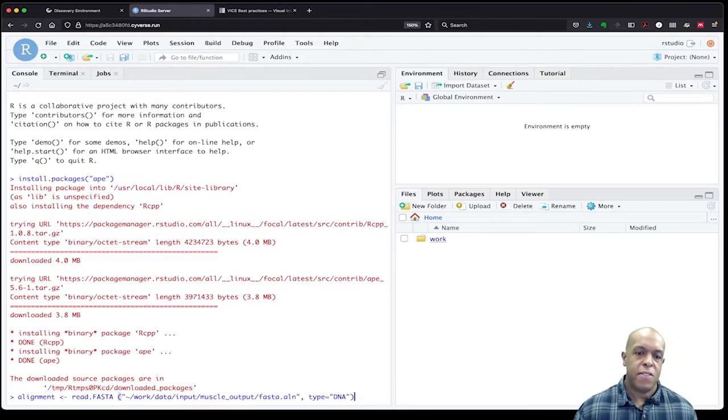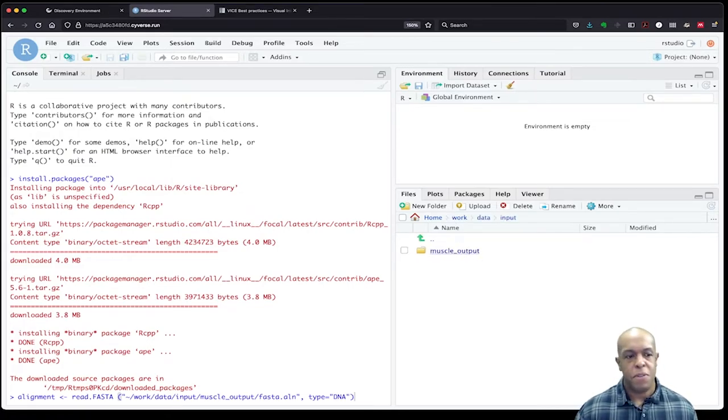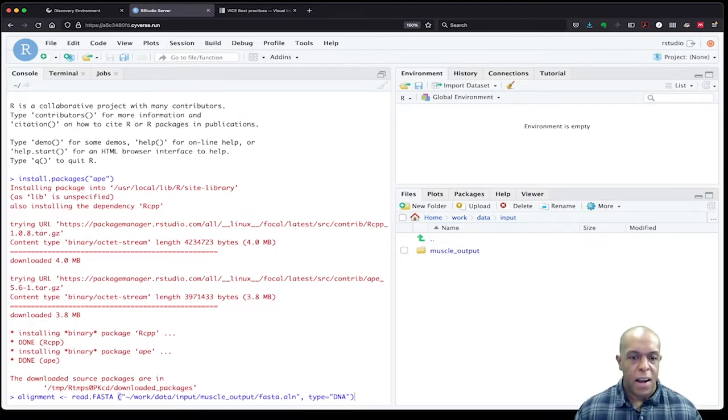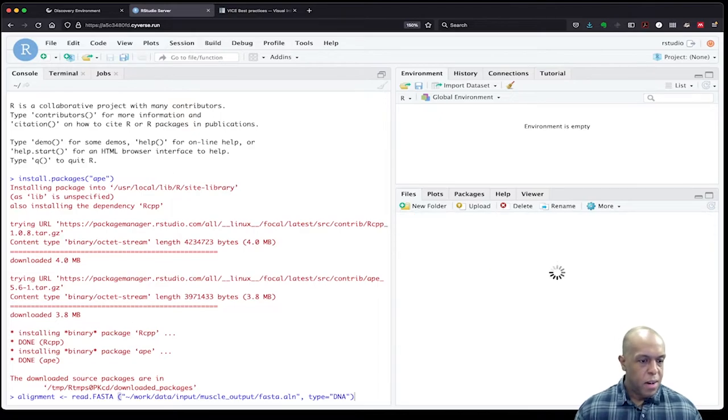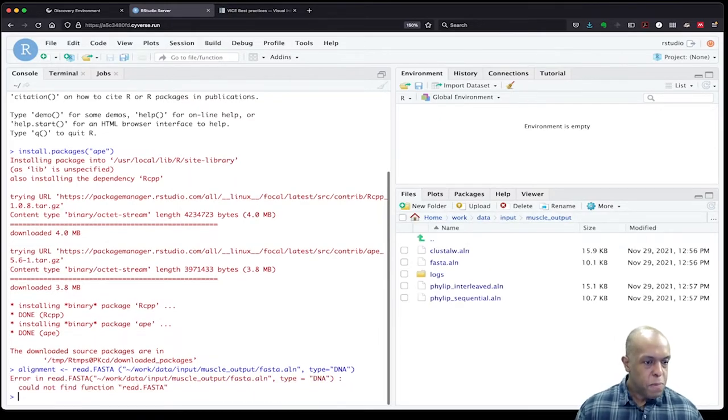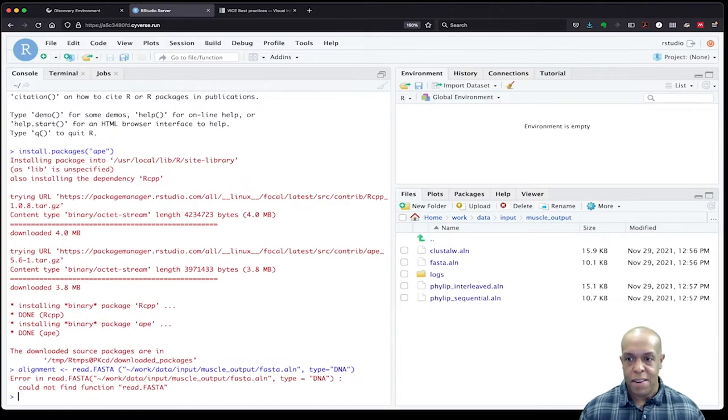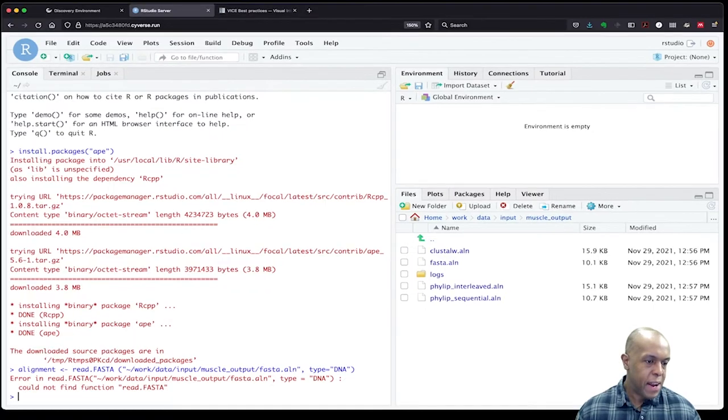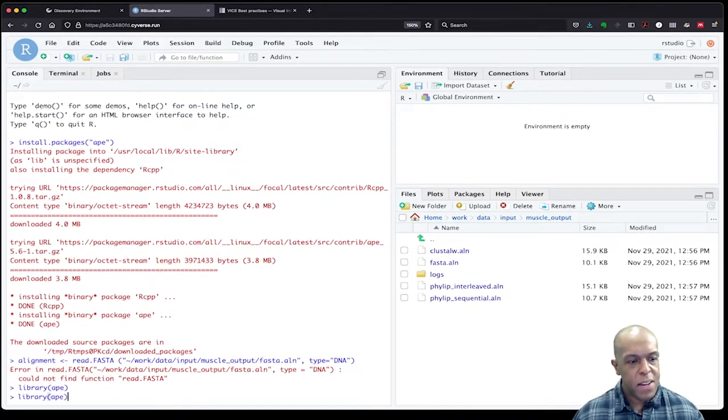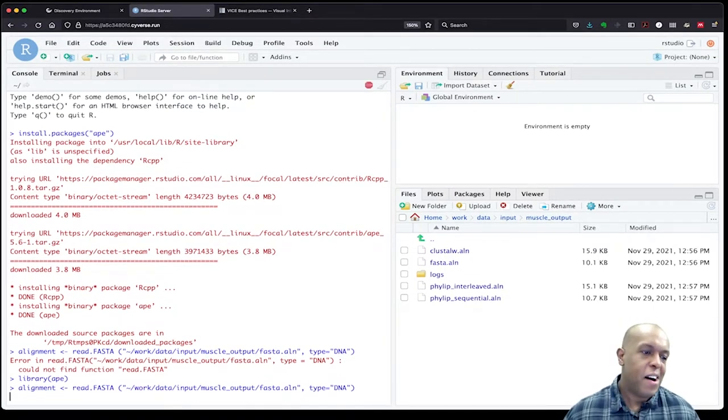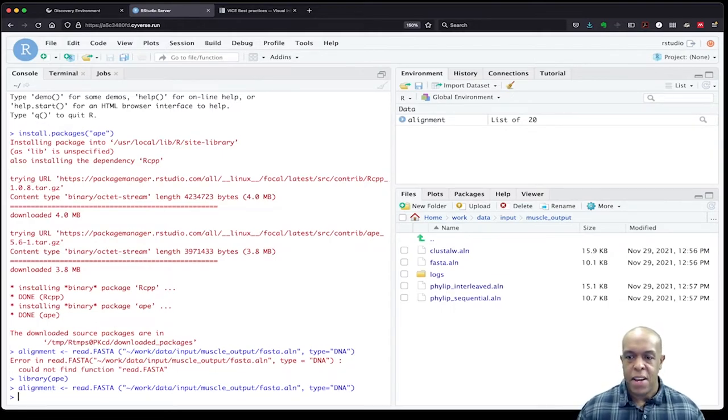In your work directory, which is going to be automatically created for you when you start this, if I go to work and I go to data and then input, there is the muscle input folder that was brought in, so this path should correspond to that. And if I go back, oops, I forgot you should go ahead and load the library—see how quickly things can get away from you. So let's load that library, and now go ahead and do the read.fasta, which is a function of that ape library.